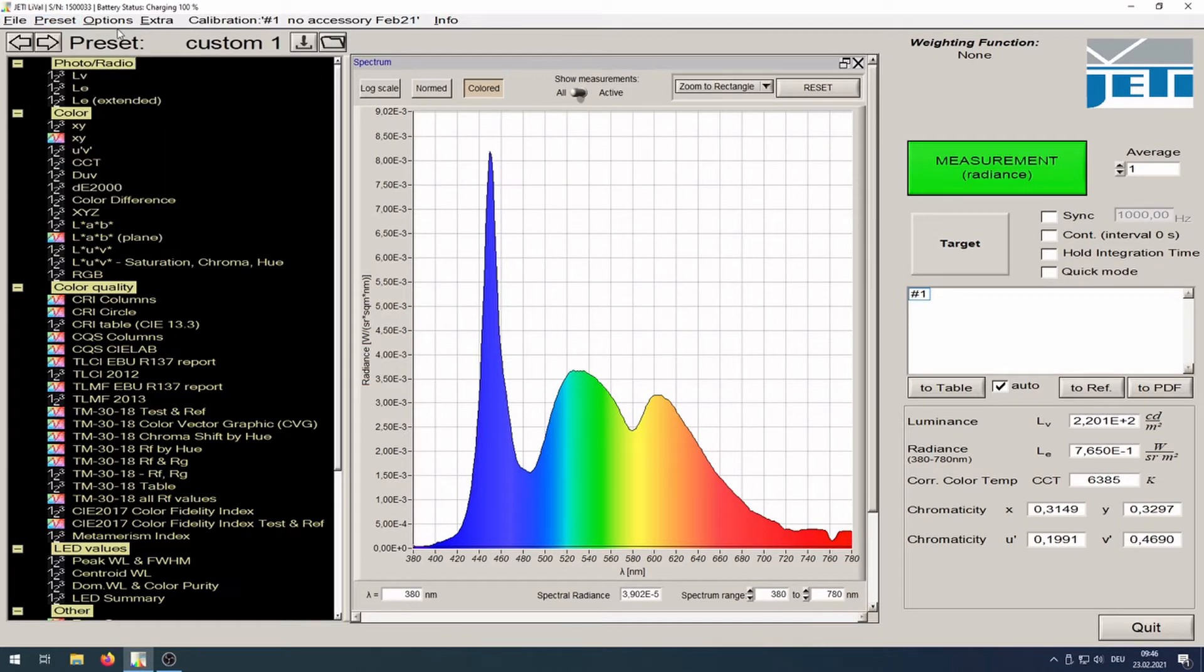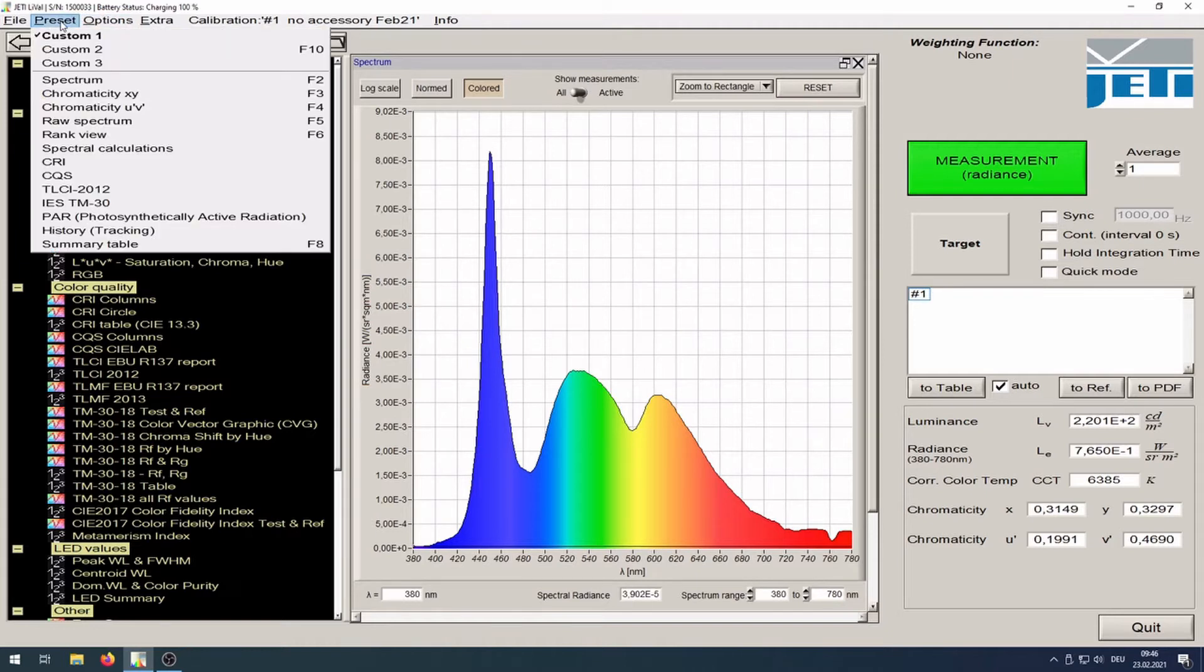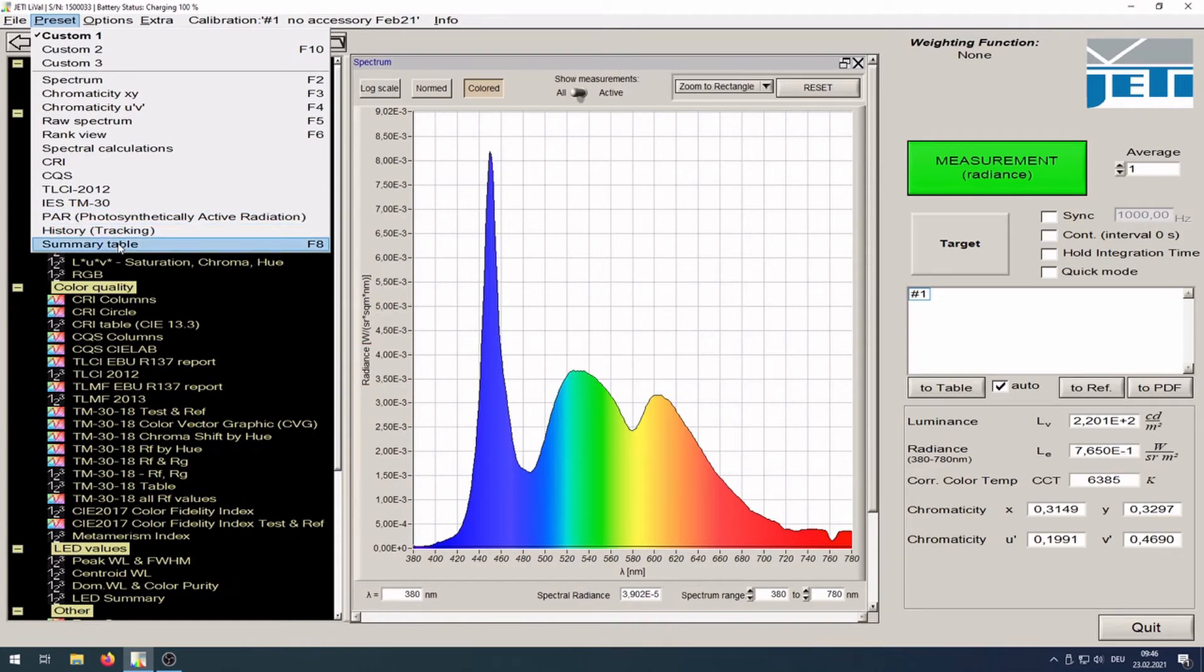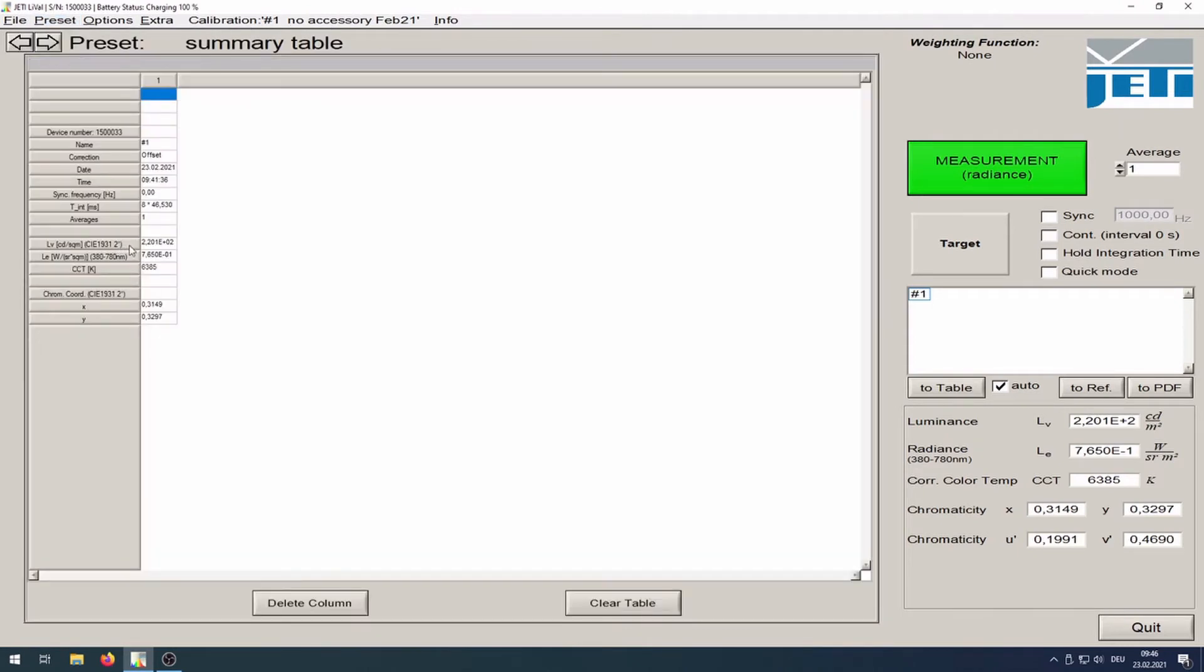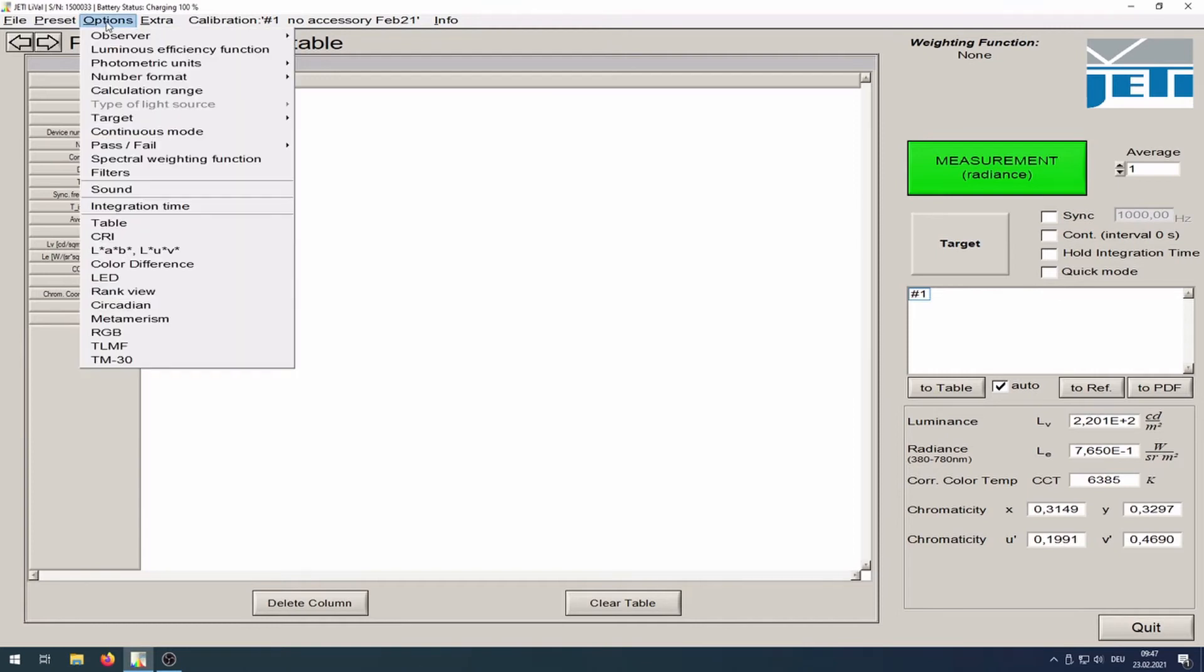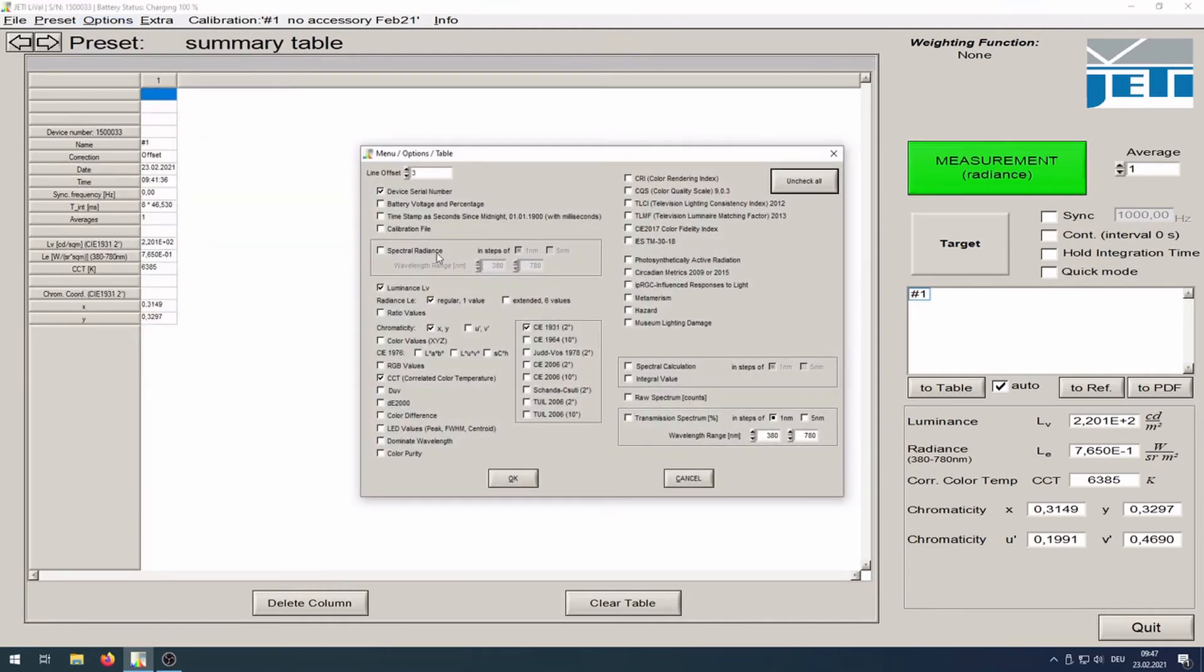Storage of measuring data transferred into the table view: select preset summary table or use the shortcut F8. If you need more than the pre-selected values, go to options table and mark the desired values.